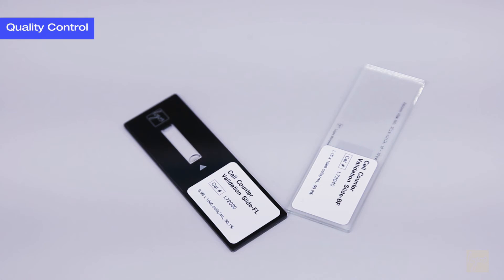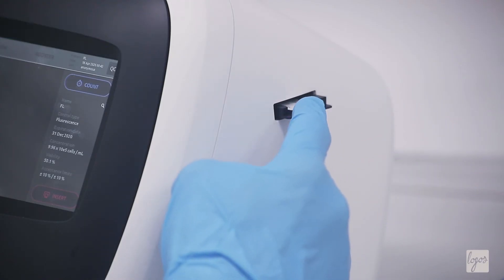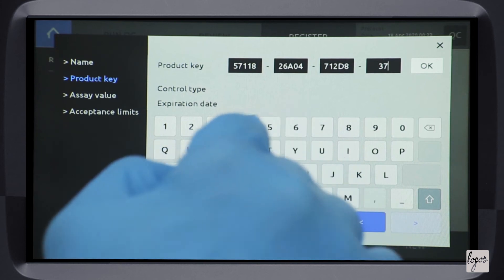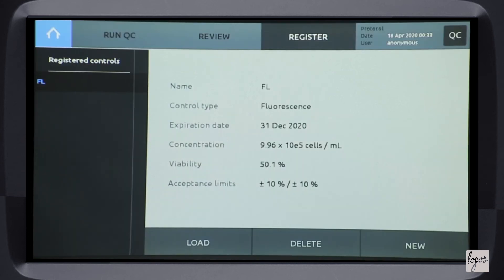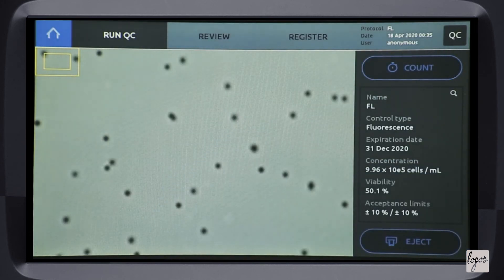Our innovative quality control feature ensures that you can be confident in your data. Cell concentrations and viability may be validated using our pre-spotted fluorescent or brightfield validation slides, while the QC functions allow you to store, monitor, and analyze the QC data over time.